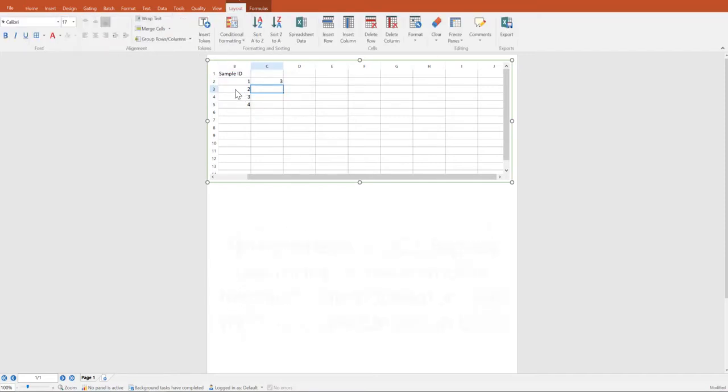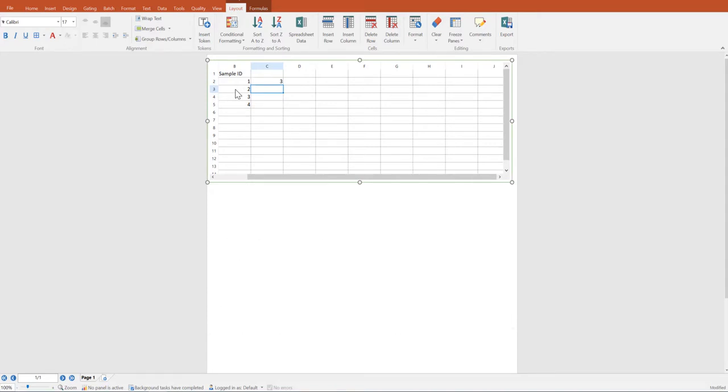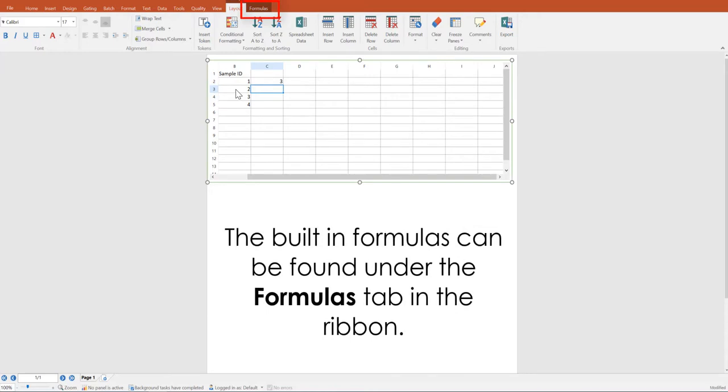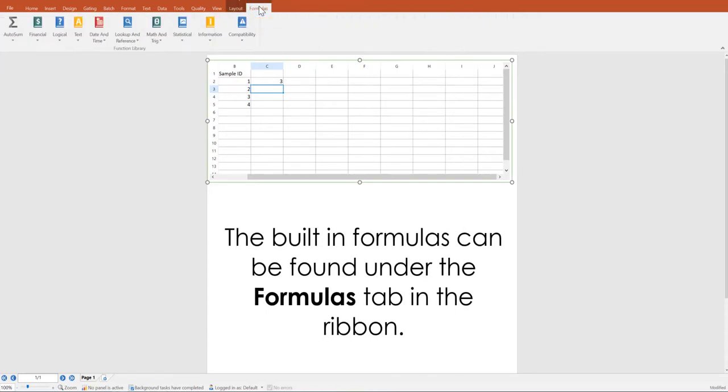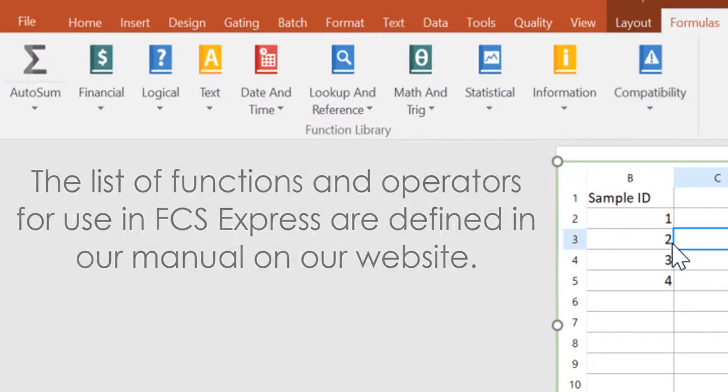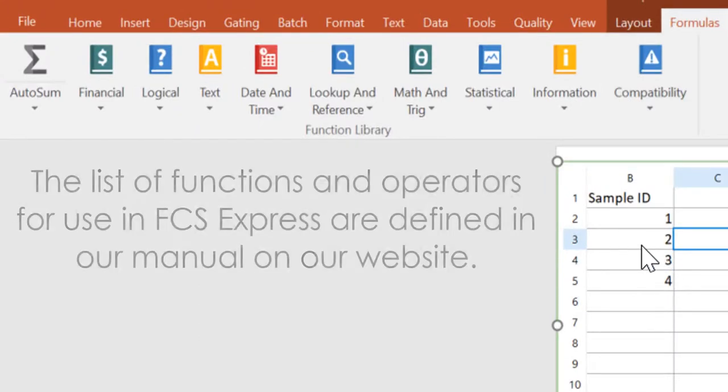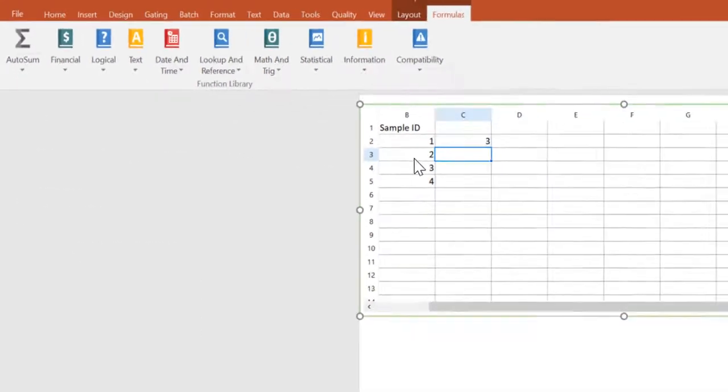Spreadsheets in FCS Express use many of the formulas, functions, and operators with which you are familiar in Excel. The built-in formulas can be found under the formulas tab in the ribbon. The list of functions and operators for use in FCS Express are defined in our manual on our website if you have any questions.